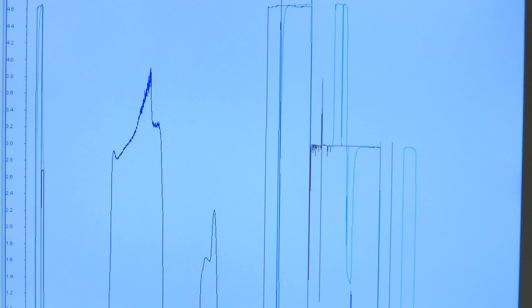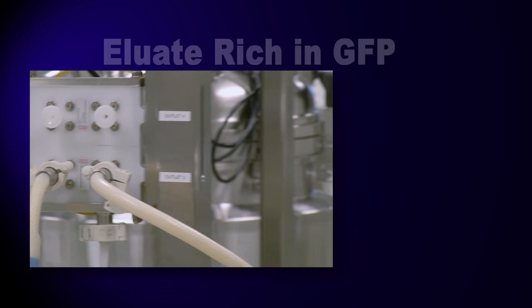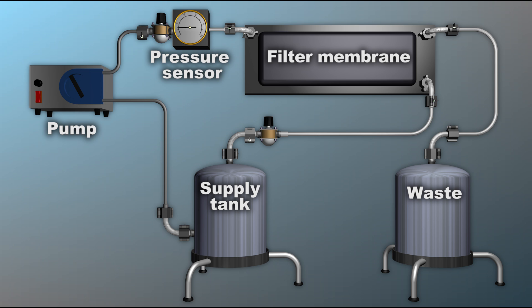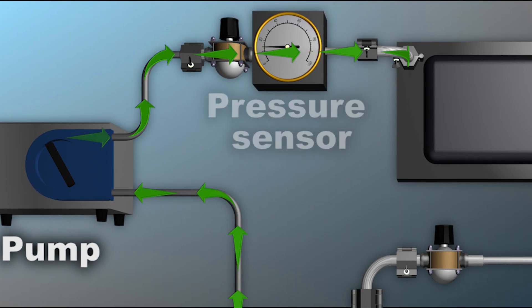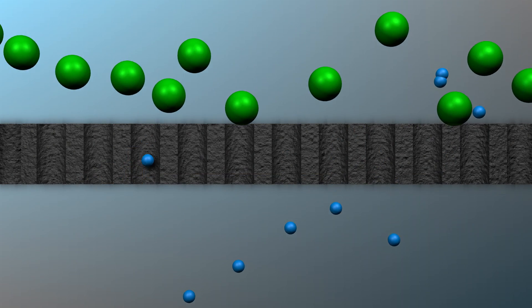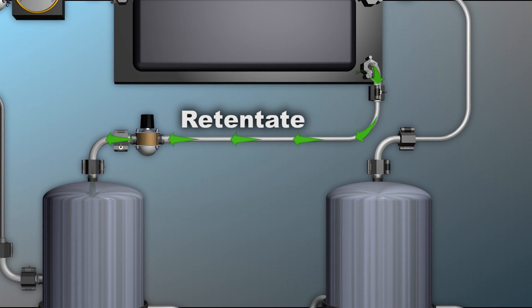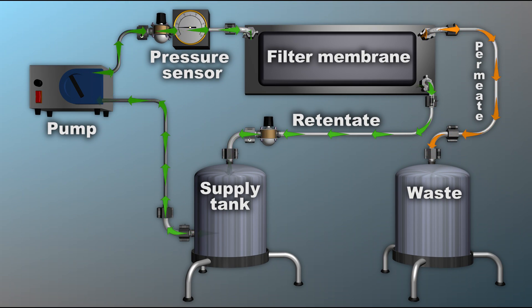At this point in the process, tangential flow filtration will be used to concentrate and diafilter the GFP product stream. The eluate is rich in green fluorescent protein, but it's still too dilute and too high in salt. As the solution moves through the TFF apparatus, it leaves the supply tank, is pulled through a pump, past a pressure sensor, and then across the filter membrane. Everything that passes through the membrane — including the buffer solution — is known as permeate and is sent to waste. The GFP protein is larger than the pores of the membrane and therefore is retained. The retained material, called retentate, is recirculated to the supply tank. Recirculation of the feed continues until the desired concentration of GFP is achieved.